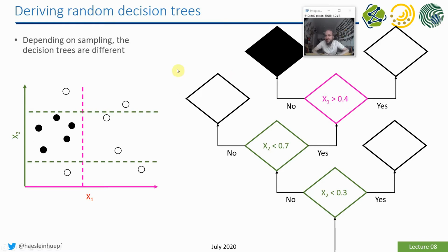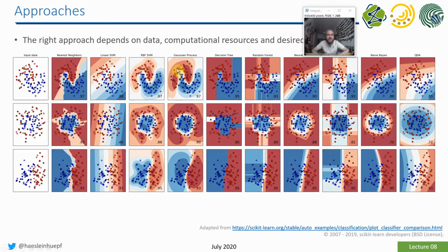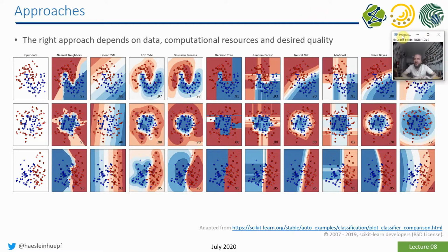That's the random forest algorithm. Just remember that it's not just one algorithm which is machine learning. There are many different algorithms, and we did not go through them in detail. Depending on what you want to achieve, there may be a good algorithm for that, or a random forest may not be able to do that, and then you should look out for potential alternatives.